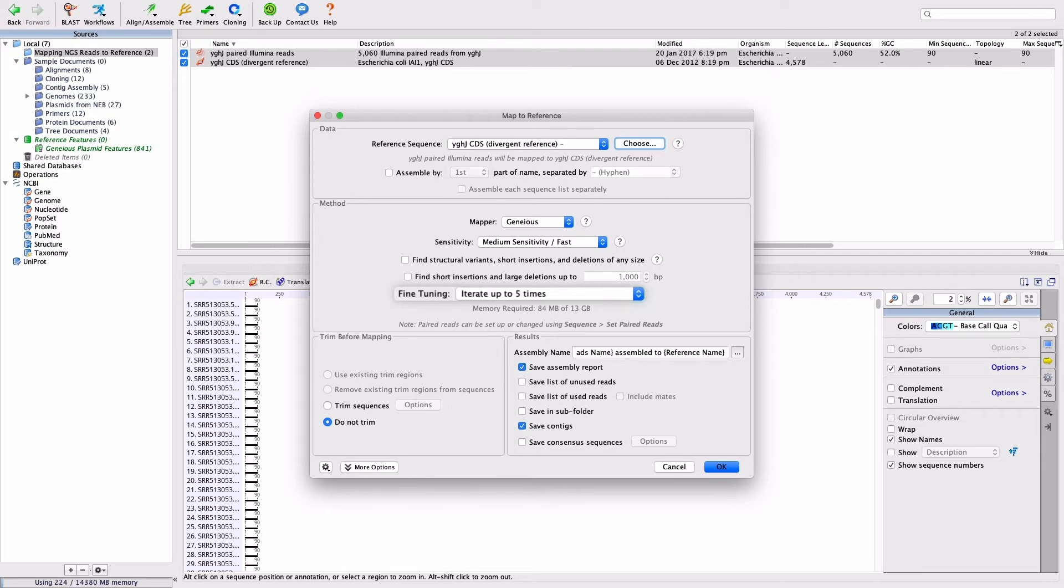The fine-tuning option can improve the results by aligning reads to each other in addition to the reference sequence. Set this on Iterate up to 5 times.